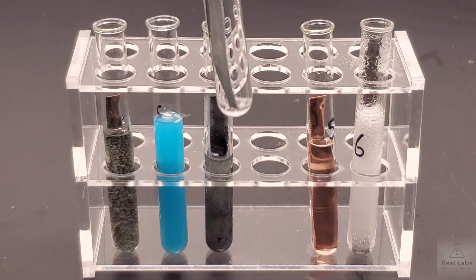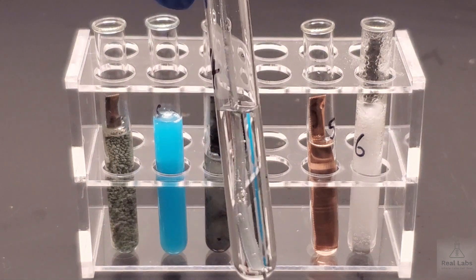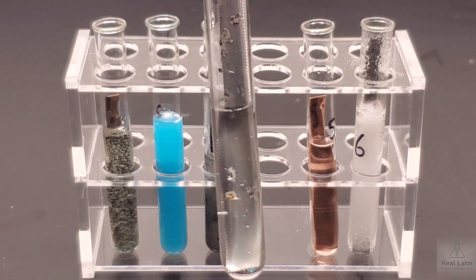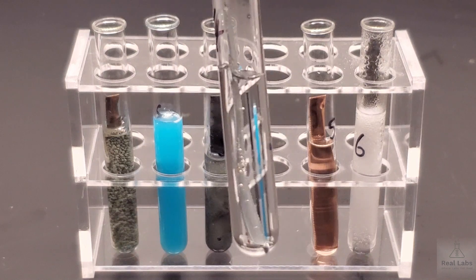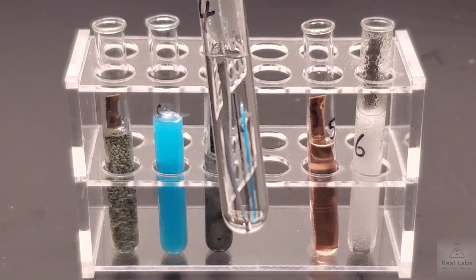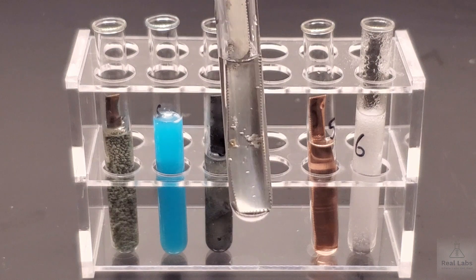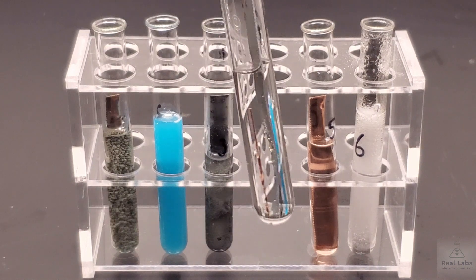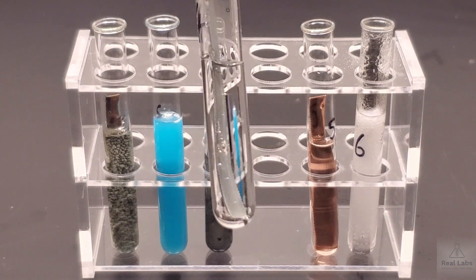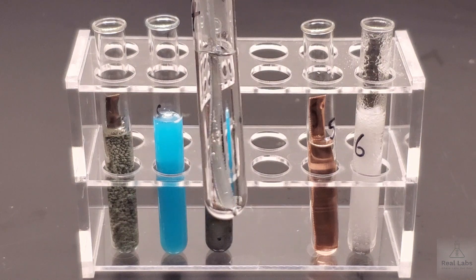In the fourth test tube here, we have the zinc strip with magnesium sulfate. You can make your observations. If you think something's happened, explain what you see, what you think you see has happened. If not, you can say there's no reaction or there was no change in the system. That's how you would note if you think there's nothing happening.